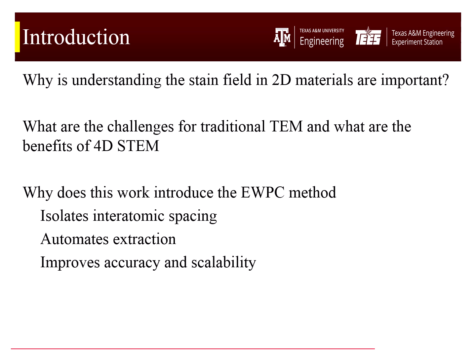One crucial innovation this work introduces is the exit wave power cepstrum. The EWPC enhances the analysis of 4D-STEM data by isolating key diffraction information, allowing for automated, accurate, and scalable strain maps across complex nanostructures.